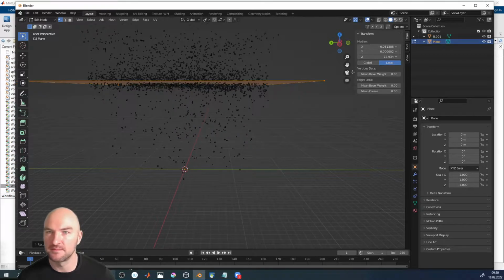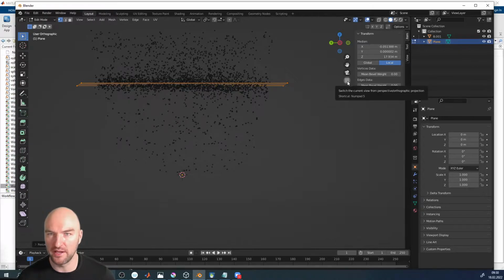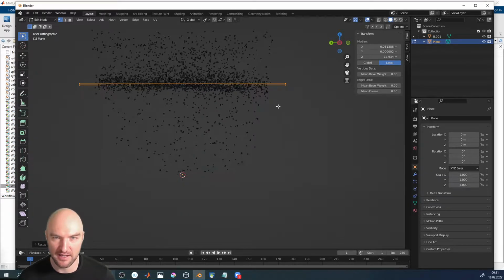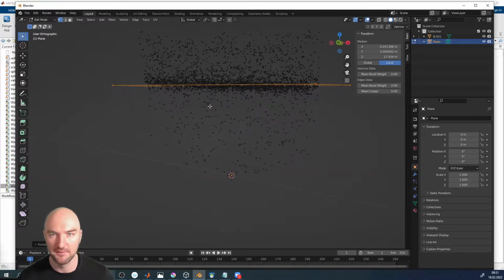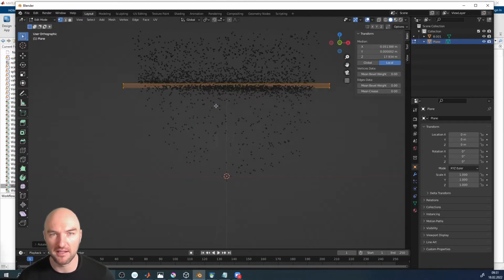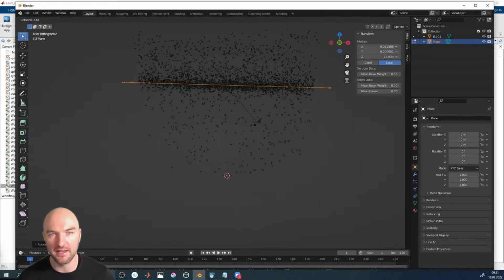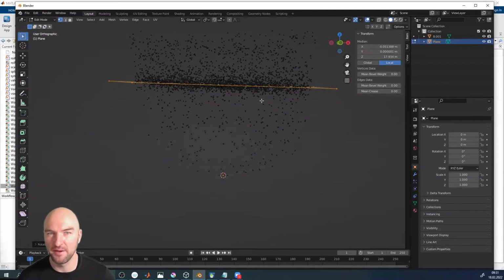And preferably do that in orthogonal mode, so that you actually get a good view on your object. And in this case, I'll also press R for rotate and rotate the whole plane so that it outlines the grain boundary pretty okay. And then maybe look again at 90 degrees to that, and rotate the whole thing again. And, well, we have a pretty good model for our grain boundary now.